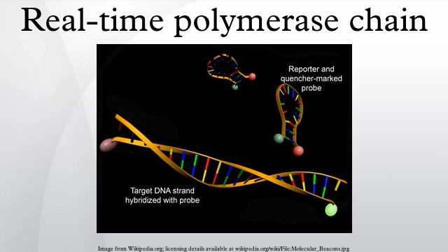To ensure accuracy in the quantification, it is usually necessary to normalize expression of a target gene to a stably expressed gene. This can correct possible differences in RNA quantity or quality across experimental samples. Fluorescent reporter probe method. Fluorescent reporter probes detect only the DNA containing the probe sequence. Therefore, use of the reporter probe significantly increases specificity, and enables quantification even in the presence of non-specific DNA amplification.